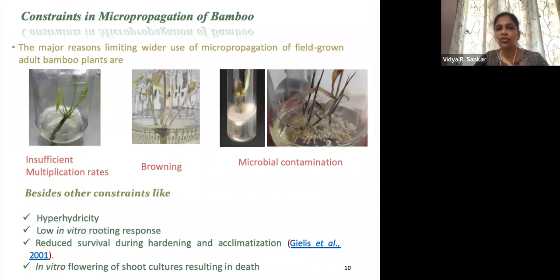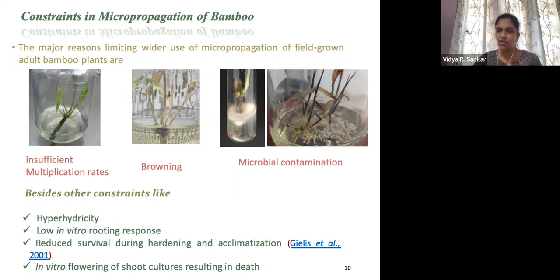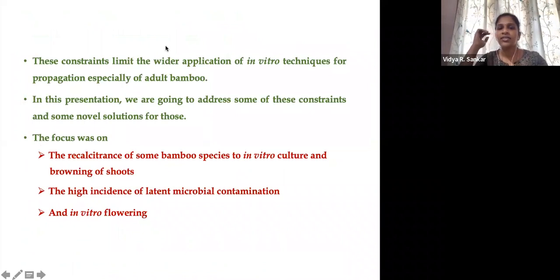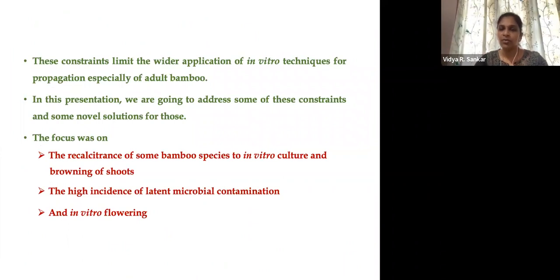Although protocols are available for 54 species, there are still many constraints for the development of successful micropropagation methods. The major restrictions are insufficient micropropagation rate, tissue browning, and microbial contamination. Besides these, we have hyperhydricity, low in vitro rooting response, reduced survival during hardening and acclimatization, as well as in vitro flowering, which leads to the death of the culture.